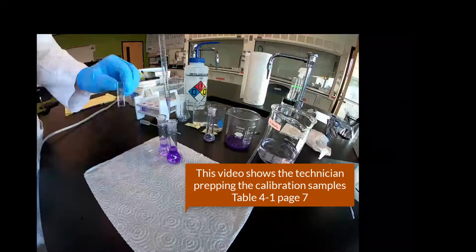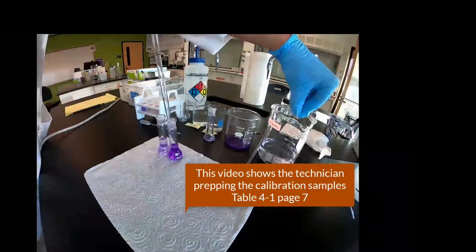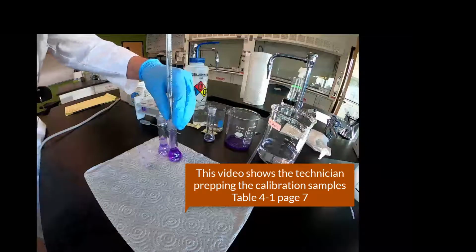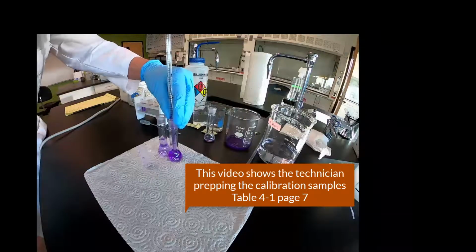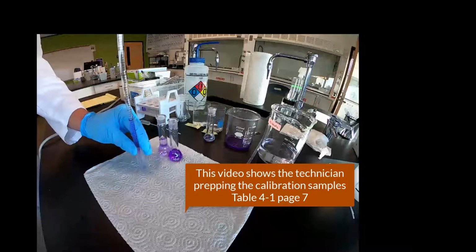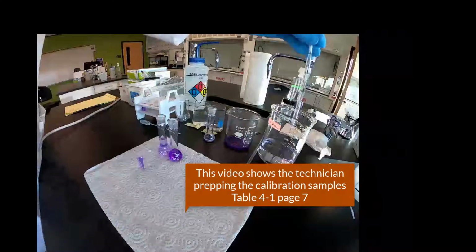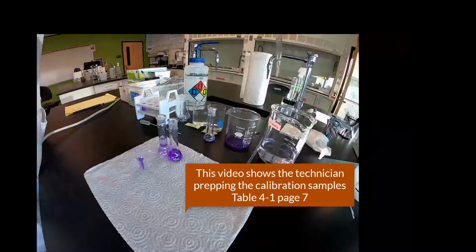This is not a precise depth measurement. Just get past the optical glass. If you go over, it won't change anything. You just can't go under, but you can go over, just fill past the glass. There you go. That's plenty. You can see how it expands out. That means he's past the optical glass. All right. So now that's the sample number 2.